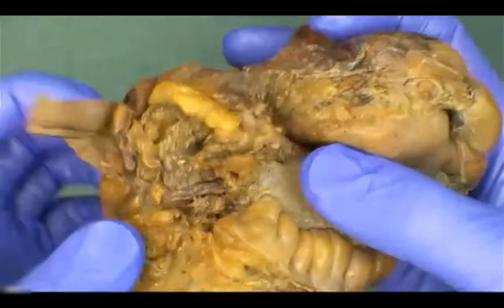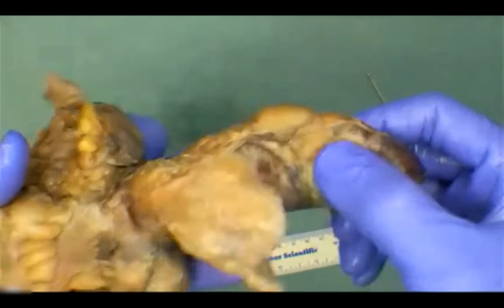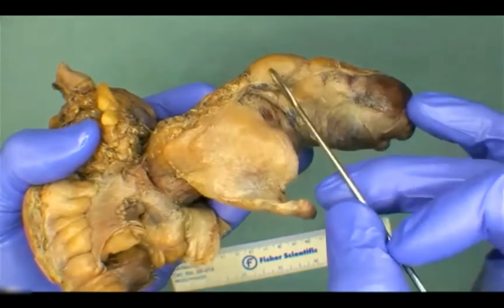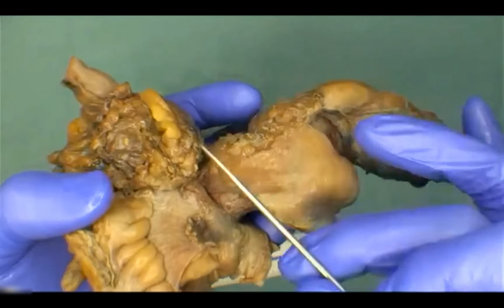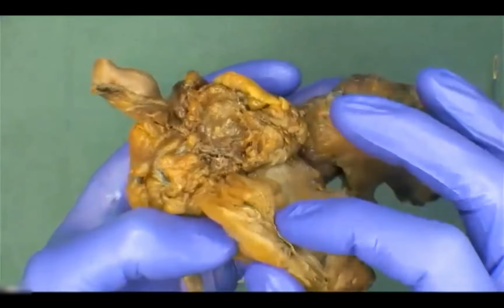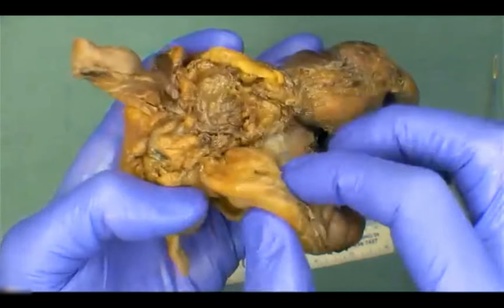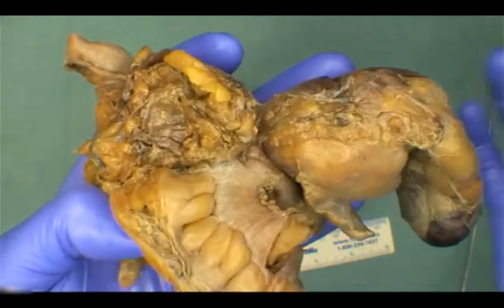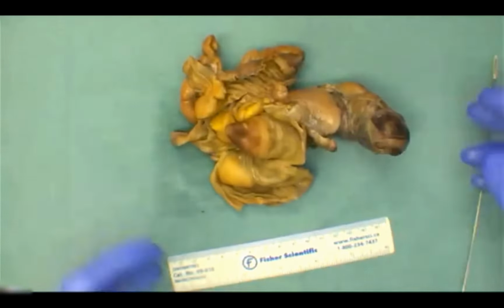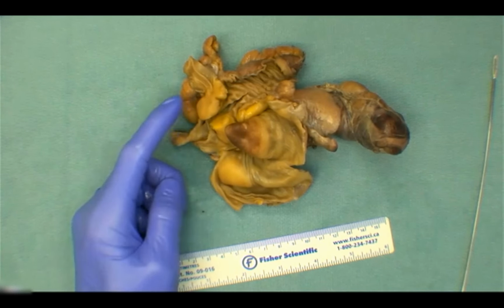Here it gets perhaps not as clear, but I think the mesoappendix on this case is intact here. That's all of this fat here, and that would have come out without any specific resection. So I think we can consider that there's 3 margins on this specimen. And I think the most important ones here are that proximal and distal one, because the small bowel one was just a bit away, perhaps less contributory to the pathology we're seeing. From here, we would take sections of our specimen. We'll take our margins as sections, and some additional findings with the submucosal lipomas.